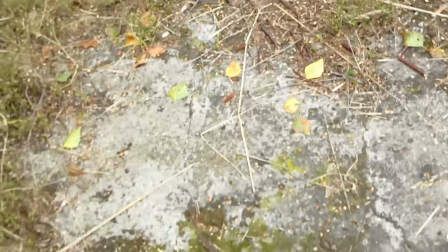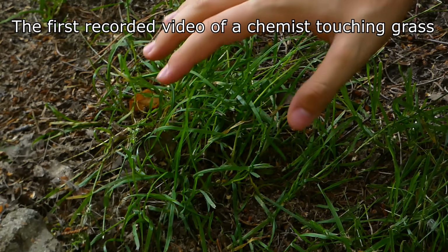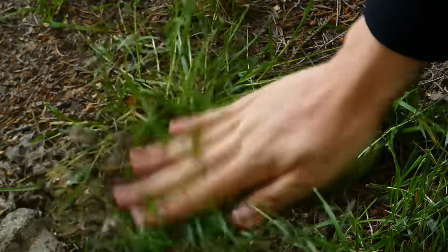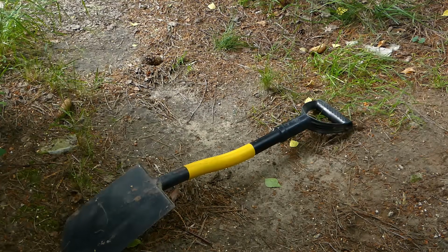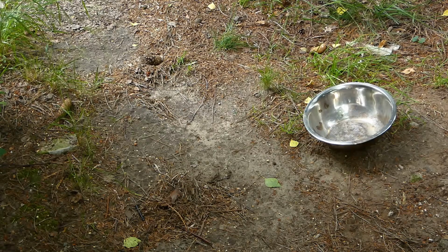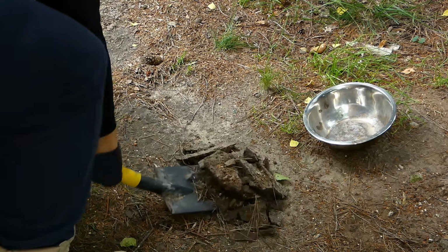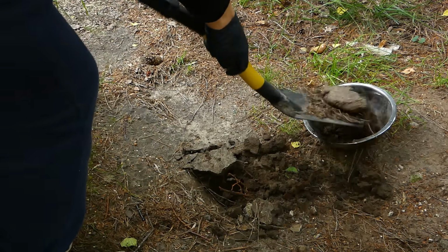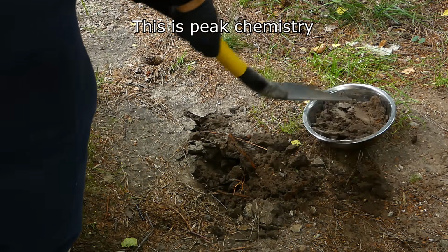to go outside. After a bit of hesitation, I am now outside, and the first thing that I did was to of course touch some grass, which was a pretty interesting experience, and after that, I found myself a path of exposed soil, got a shovel along with a metal bowl, and started to dig up some of it. I know that getting reagents from the ground is a pretty nice thing, but when your reagent is literally the ground, you have really achieved peak chemistry.